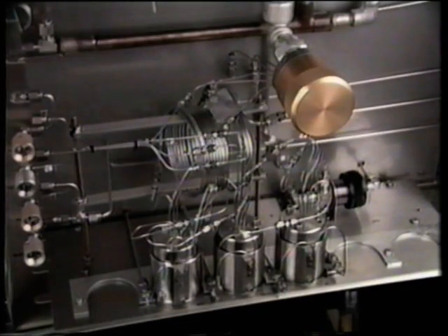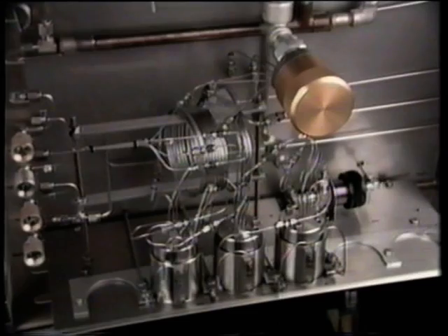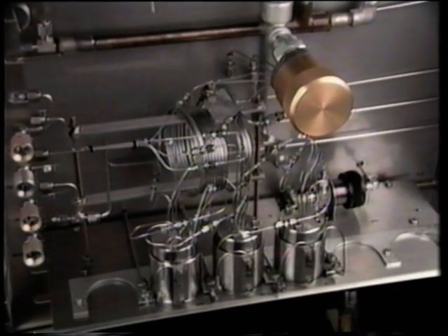Sliding plate valves and diaphragm valves are widely used for this purpose. Column valve design and maintenance is similar to sample injection valve design and maintenance.